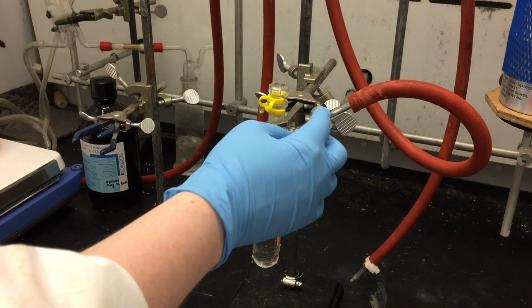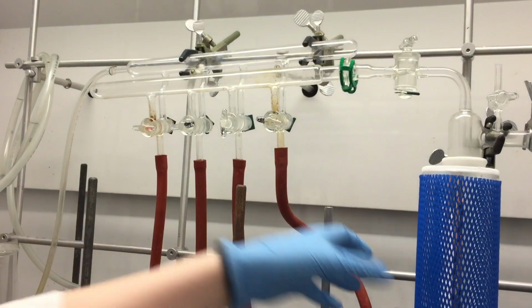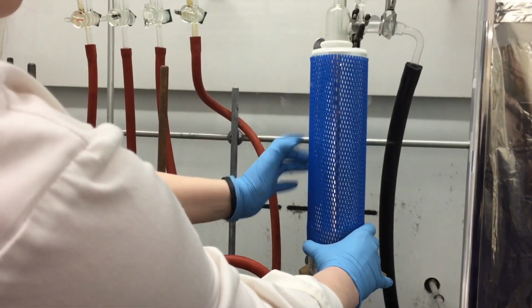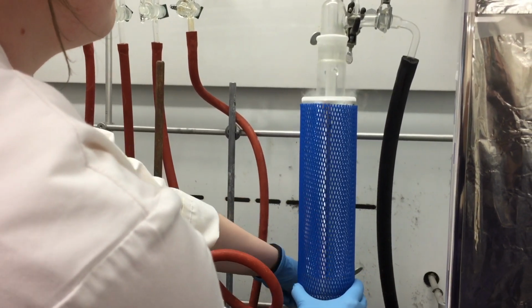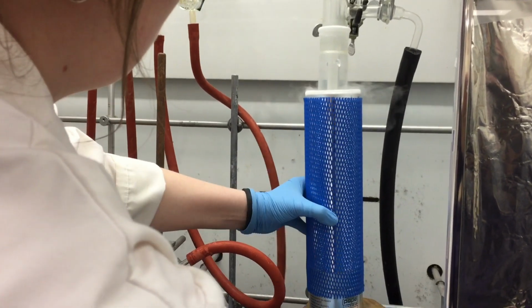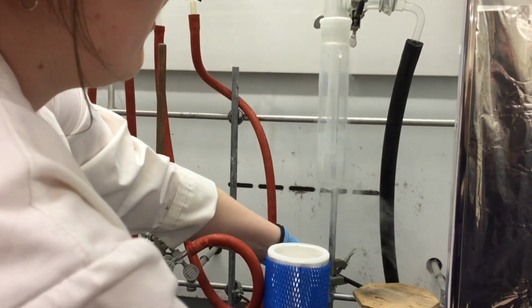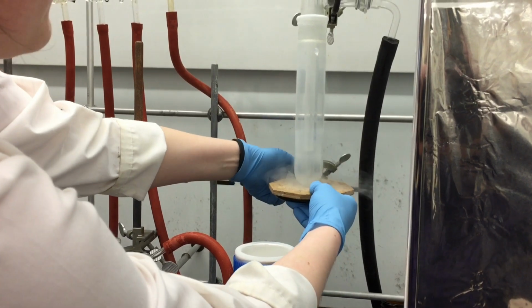Now that we are under nitrogen, we are going to turn off the vacuum, close the tap to the muck trap, and then we are going to remove the muck trap, making sure that we do so carefully. We always want to make sure that we return the trap holder up just in case the muck trap does fall.